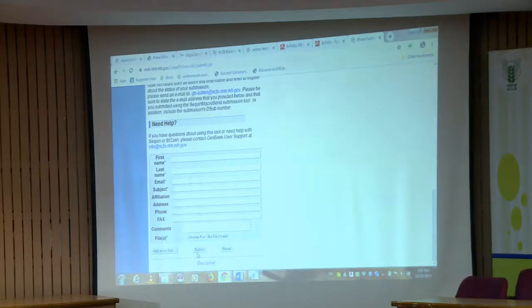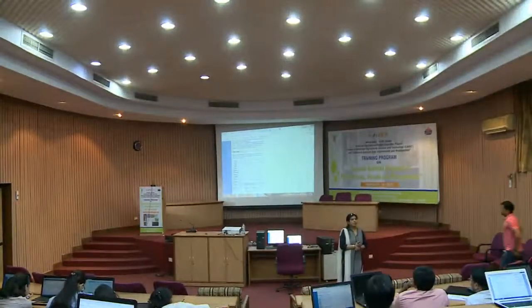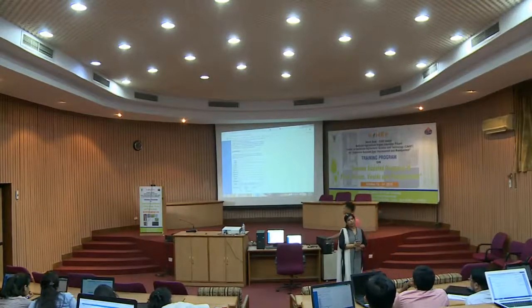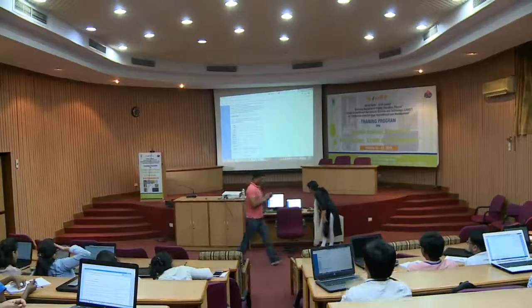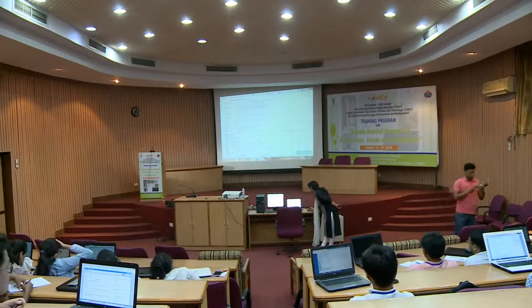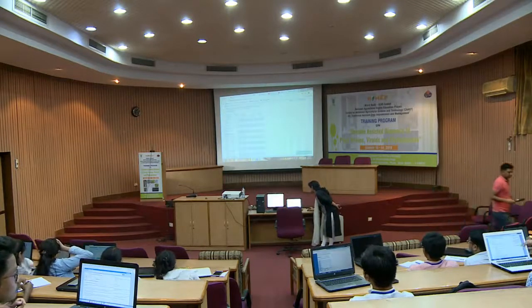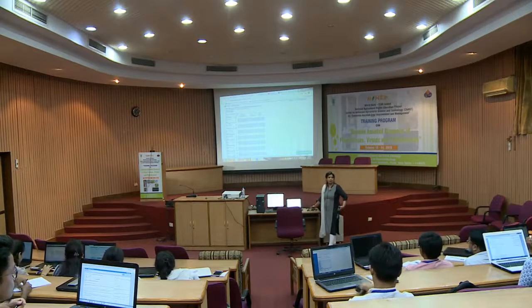Any question? Any doubt? Regions has prescribed nucleotide 1, nucleotide 230. We have to type it manually, like I had just shown you, this part. You have to actually manually count it, because it will not be highlighted anywhere.